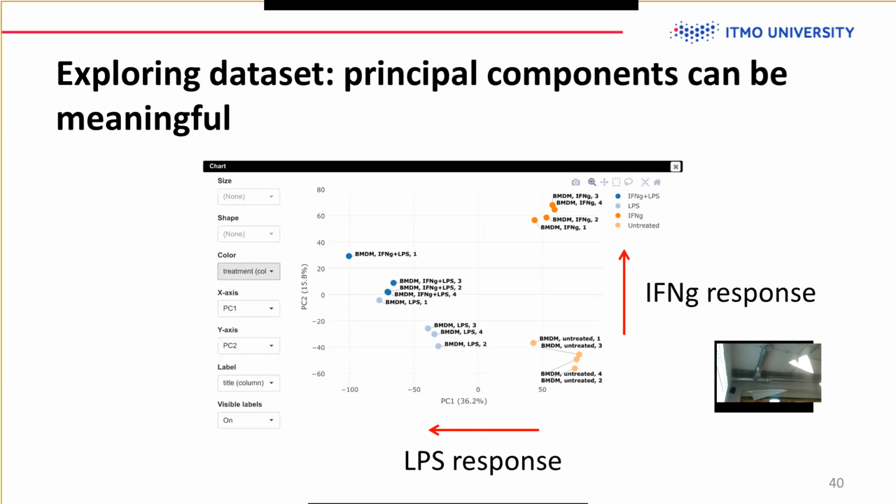Sorry, I forgot what. Like downscaling from higher dimensional space to lower dimensional space, like MDS, or the ones that you will also be working with in single-cell: t-SNE and UMAP. So these are different ways to scale down your data points to a plane, for example. But what is great about PCA, and why it's a very nice approach, is that it's linear.